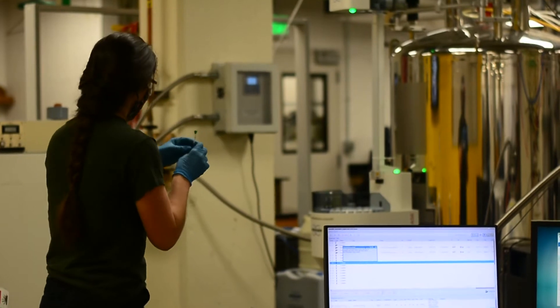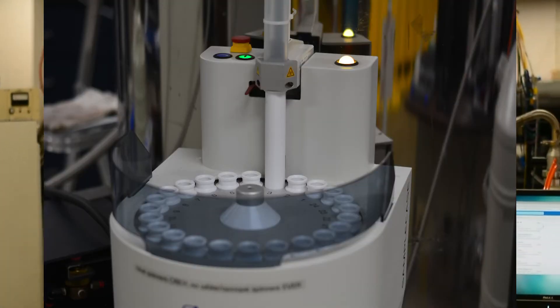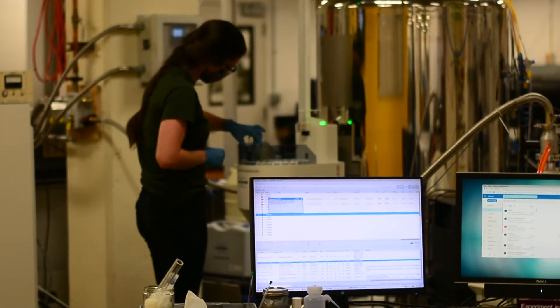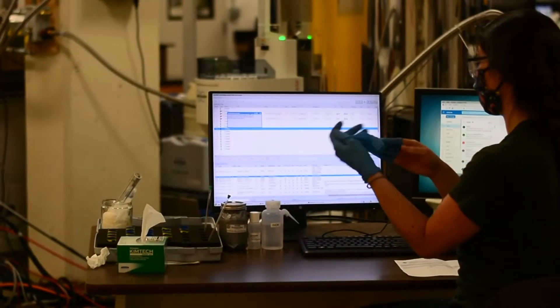Then you can find an empty slot in the auto sampler and load your sample into the auto sampler, and have a seat at the console. Remove gloves.